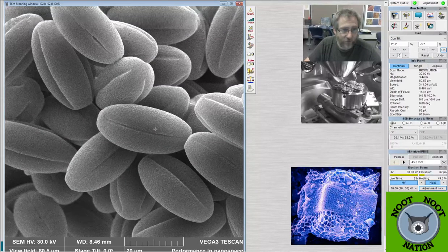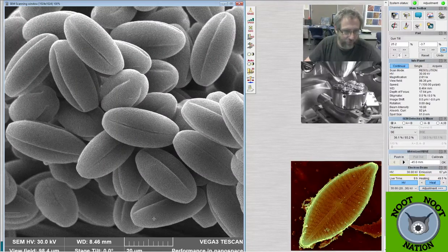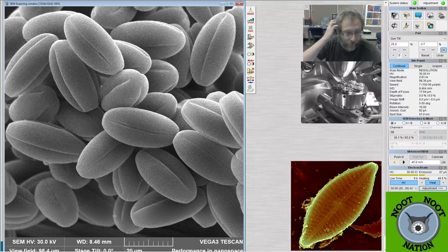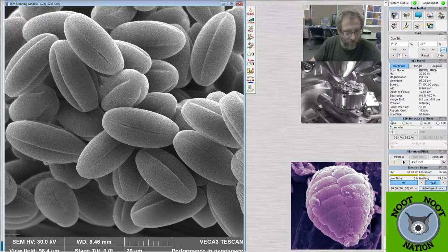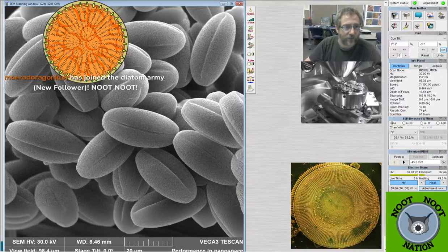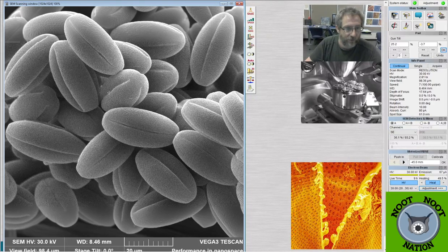But the SEM provides a unique, high magnification view, and you'll see the image quality improve quite a bit down here. That's because I have speed settings on the SEM, how fast it scans. That's the scanning part of the scanning electron microscope. When I want to take a picture at higher resolution, I can slow it down so that it scans more slowly, and then there's more detail as a result. So you can really see a lot of the reticulated structure and these little creases or folds that run through the middle of this pollen grain.